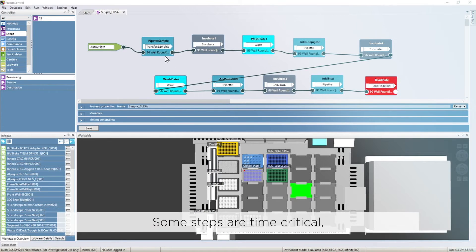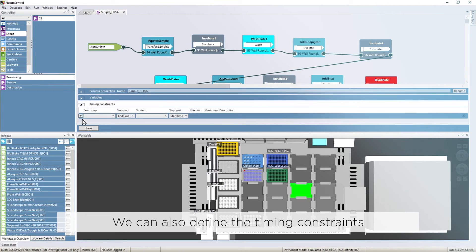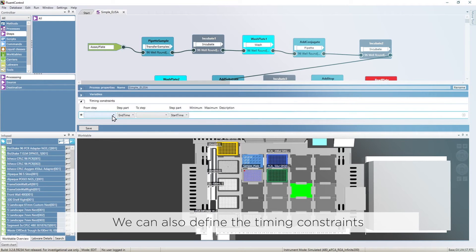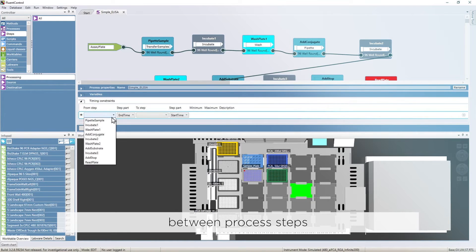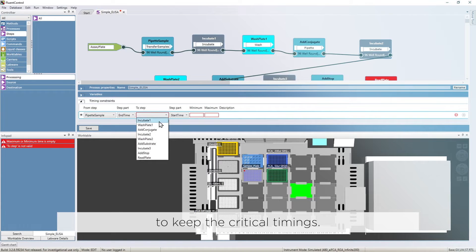Some steps are time critical, such as an incubation after reagent addition. We can also define the timing constraints between process steps that force the scheduler algorithm to keep the critical timings.